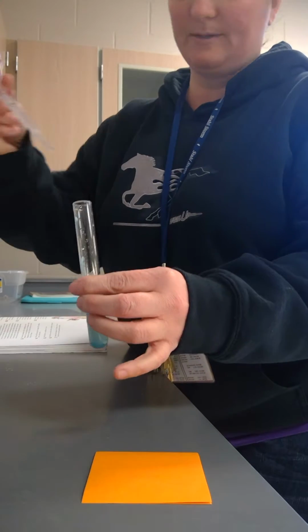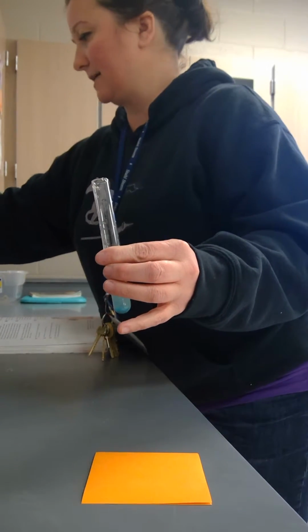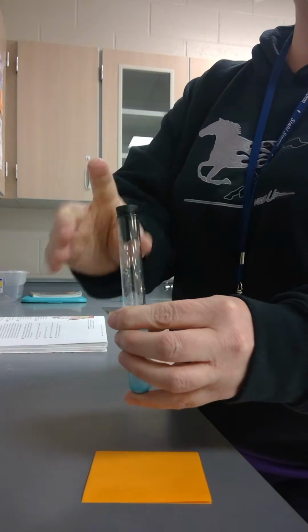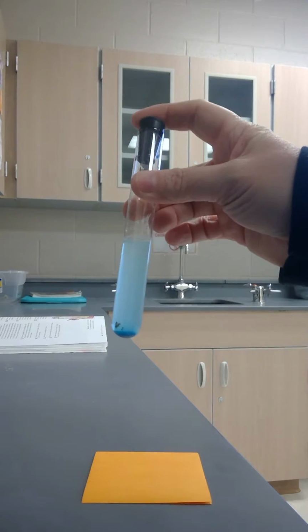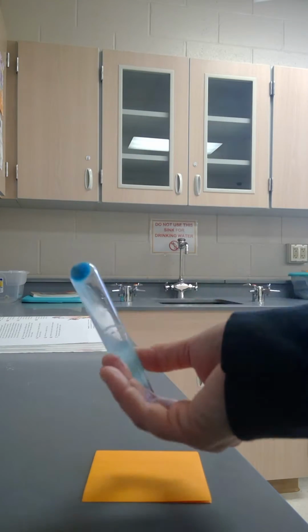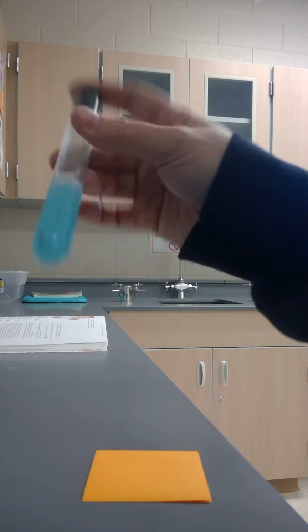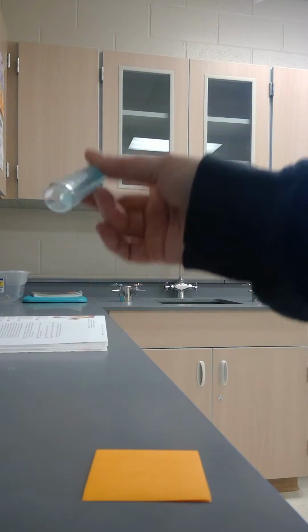Just a little bit more. Okay. And then just like I learned before, I'm going to go ahead and I'm going to cap it. Gently tap it on there, hold it with my finger. You can see that for right now, I see that it's pooling down at the bottom there. But let's see what happens when I mix it. How many times? 10, that's right. 1, 2, 3, 4, 5, 6, 7, 8, 9, 10.